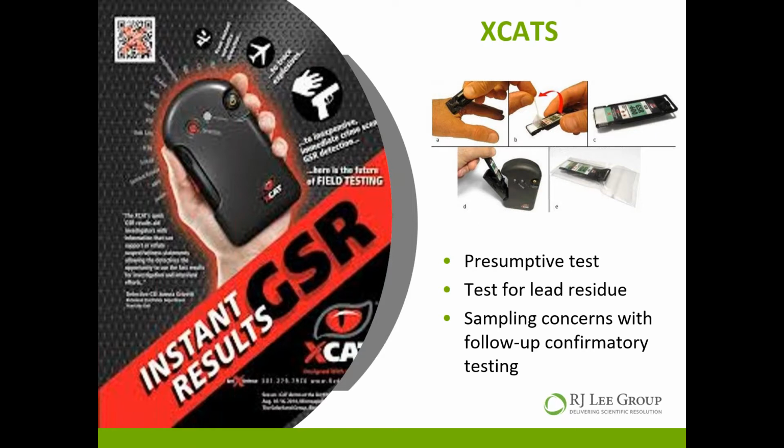The problem is this is a test for the presence of lead. There's lead in lots of different things aside from gunshot residue. It doesn't tell you whether or not primer residue is there. It can tell you whether or not lead is there. So if you get a positive result, you still have to send the cartridge to us to look at it for a confirmatory SEM test.